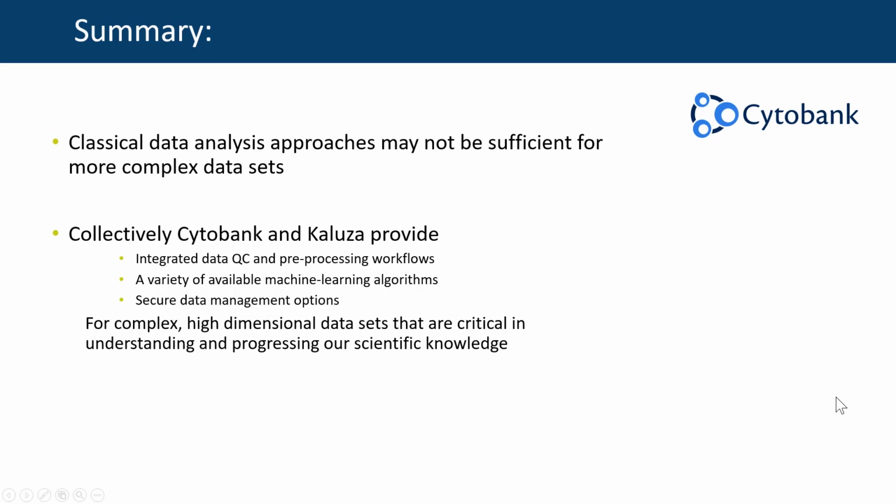And so in summary, classical data analysis approaches may not be sufficient for more complex data sets. So collectively, Cytobank and Kaluza can provide a workflow solution that's going to fit our needs. We can do integrated data QC and pre-processing workflows, either within the cloud, within Cytobank, or locally in Kaluza. We have a variety of machine learning algorithms available that don't require any coding or any plugin installation.